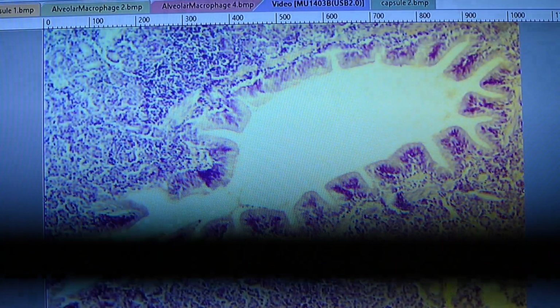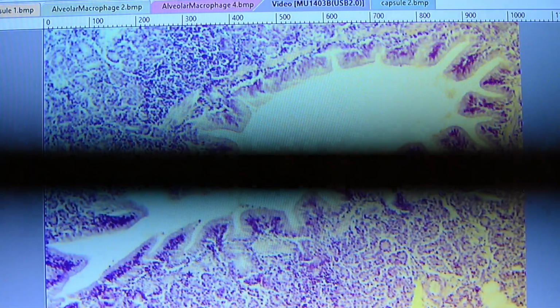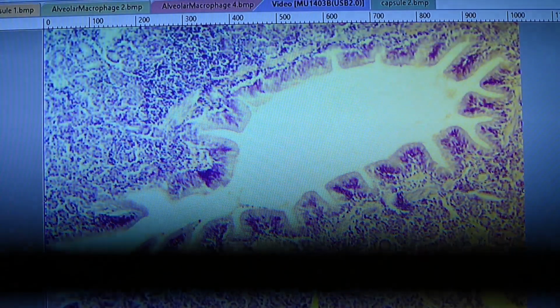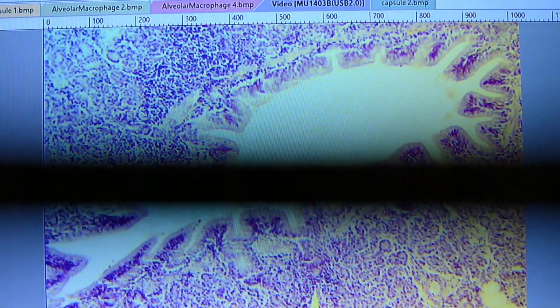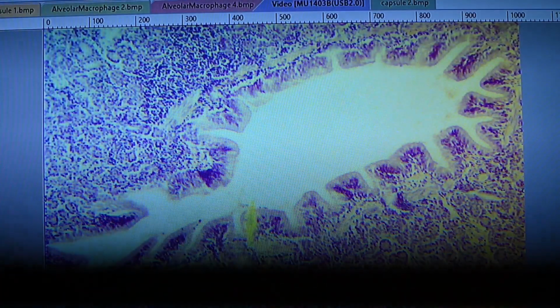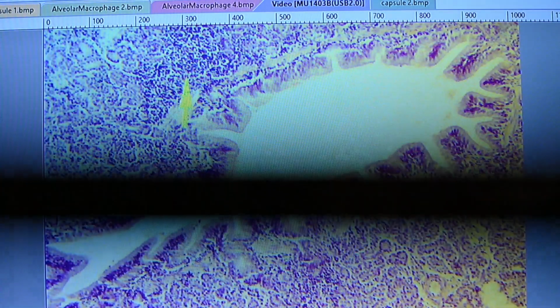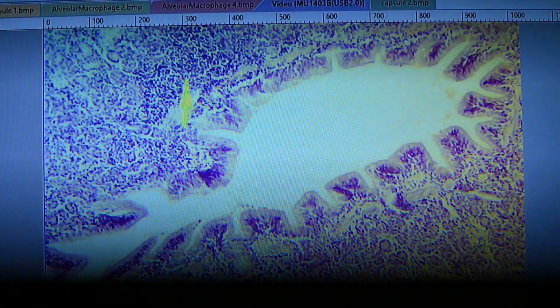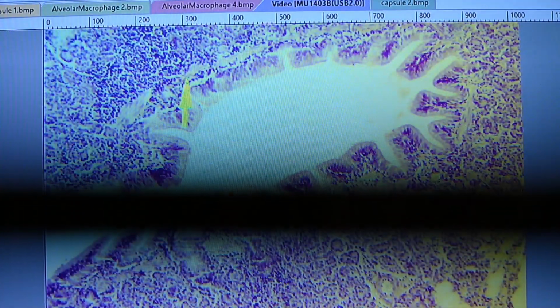I see an artery down in this corner over here, but most of this, lots of serous glands. You can see that darkened region right there, stippling with more lymphocytes. So there's some diffuse lymphatic tissue that follows the bronchi and bronchioles into the lung. There's more diffuse lymphatic tissue up here in this side. We'll magnify this wall of the bronchus a little bit more.